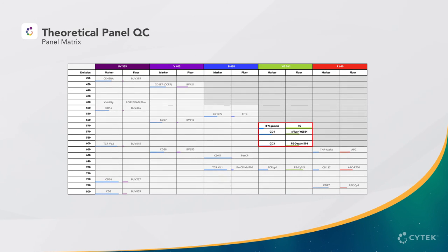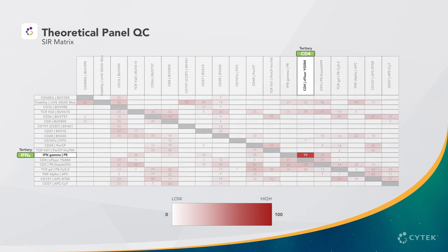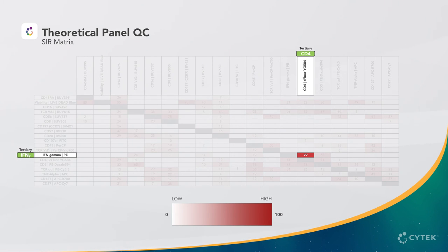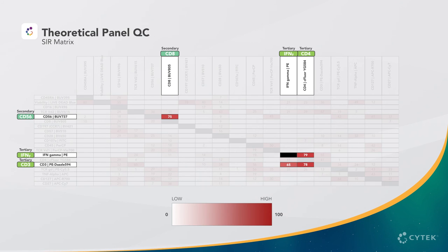We can see that interferon-gamma on PE, CD4 on cFluor YG584, and CD3 on PE-Dazzle 594 have very close emission peaks off the yellow-green laser, so let's examine them in detail. Looking at the SIR matrix, we can see that PE may impact the resolution of cFluor YG584, while PE-Dazzle 594 might impact the resolution of PE and cFluor YG584. We can also see that the SIR for BUV737 into BUV805 is relatively high. Recall that there are many factors that contribute to spread, so it is challenging to precisely predict if this combination will resolve all markers. It's up to us to decide if we want to change the panel to further minimize spread, or move forward with this panel and see how the data looks for the first iteration.